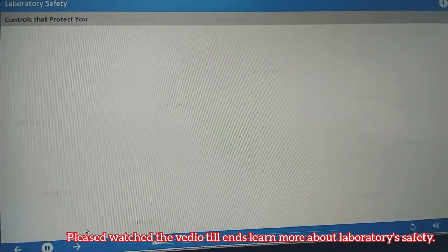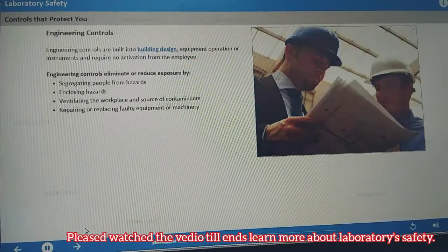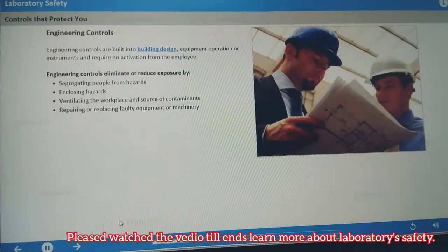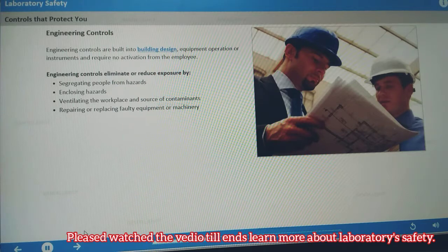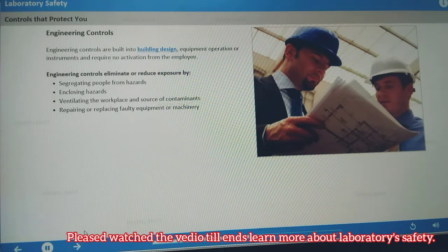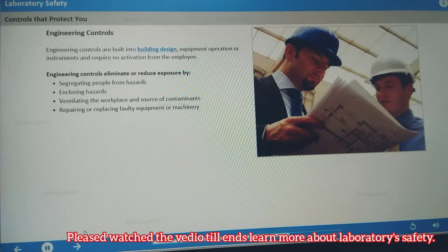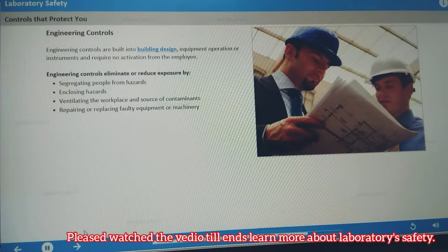Engineering controls are built into equipment operation or instruments and require no activation from the employee. Building design, ventilation systems, fume hoods, and self-capping syringe needles are examples. Engineering controls eliminate or reduce exposure to chemical or physical hazards by different methods.